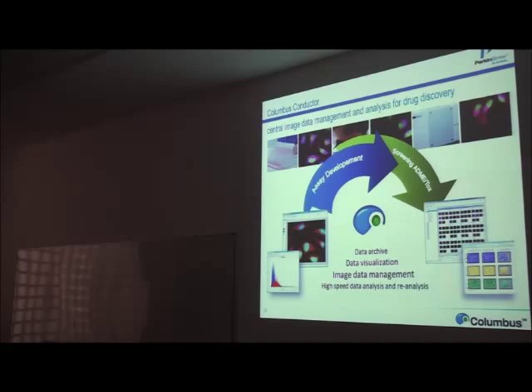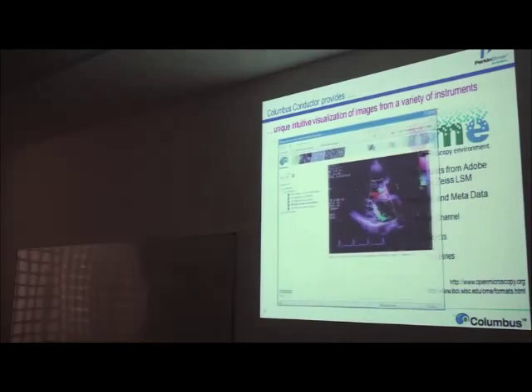Yes, it's using this OME, the Open Microscopy Environment concept. Basically, all the different providers of microscopes, like Zeiss, Olympus, us, if you generate a new format, you have to send it to OME, and OME will put it in the database. It's kind of a convention, because otherwise, for researchers, it's very difficult. You have at least 10 or 20 formats.